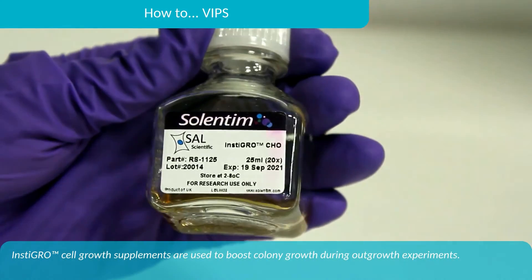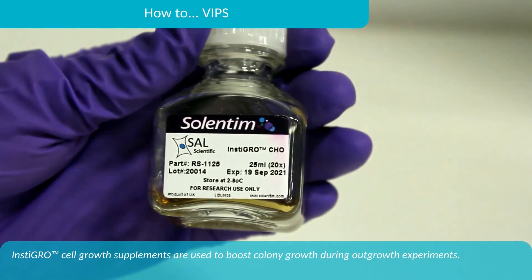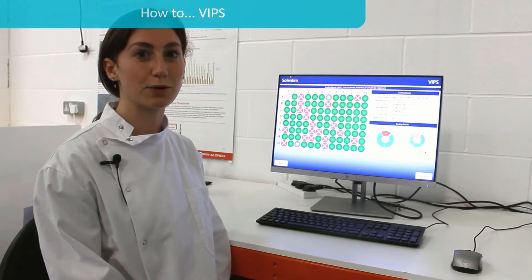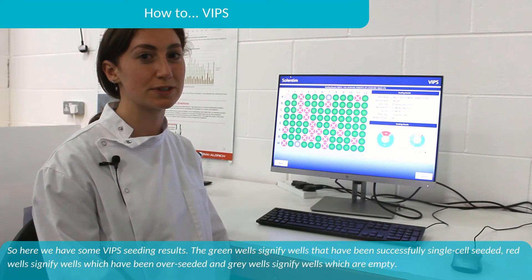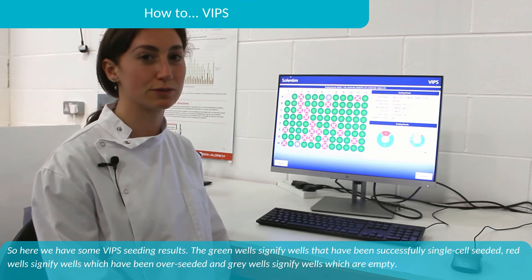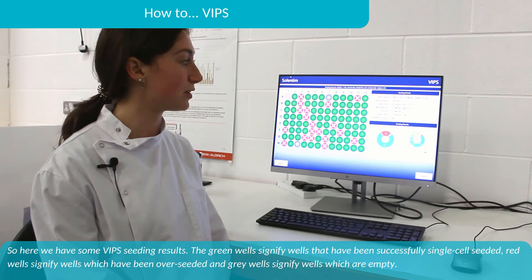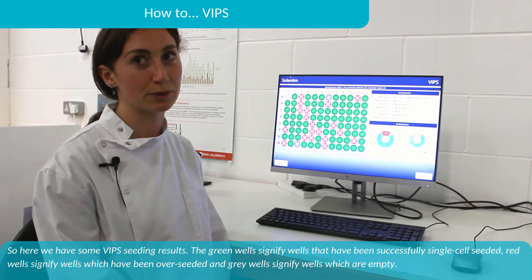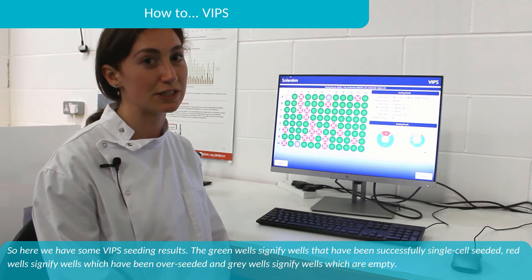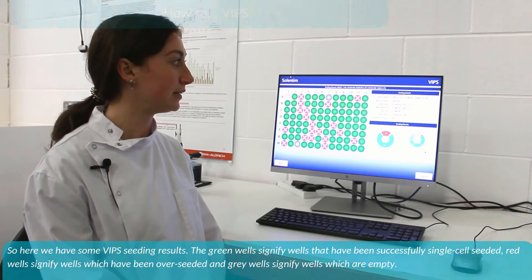Instagrow cell growth supplements are used to boost colony growth during outgrowth experiments. Here are some VIPS seeding results: green wells signify wells that have been successfully single-cell seeded, red wells signify wells that have been over-seeded, and grey wells signify wells which are empty.